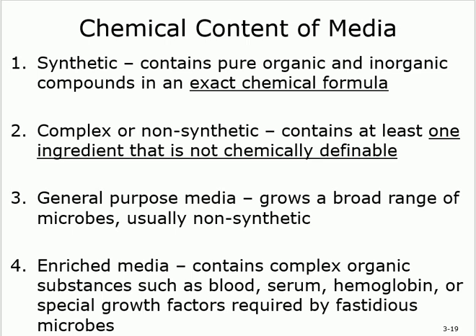The third one is general purpose medium, and this is one that can grow a lot of organisms. Obviously, that's not synthetic because you can put any organisms on it and it will grow. And from there, you can determine the next step. Either that's enough or you put it in another medium.